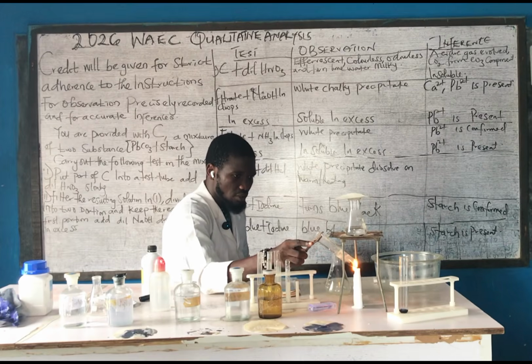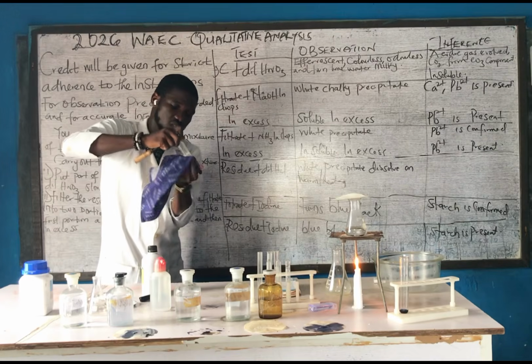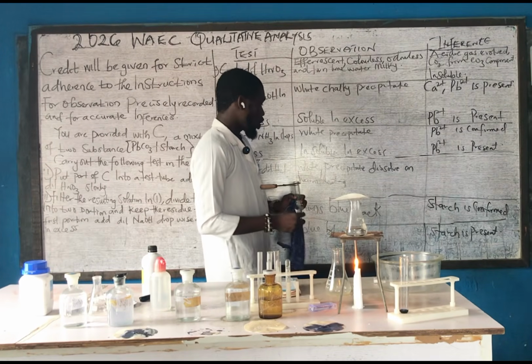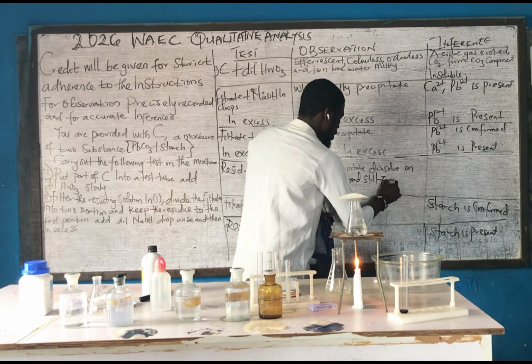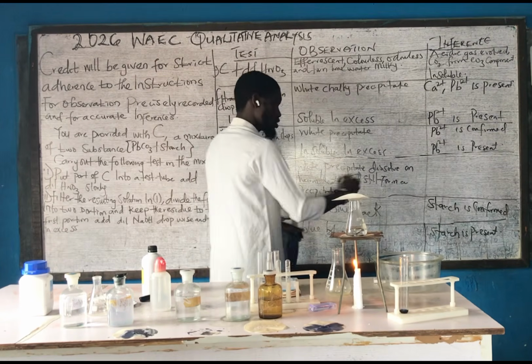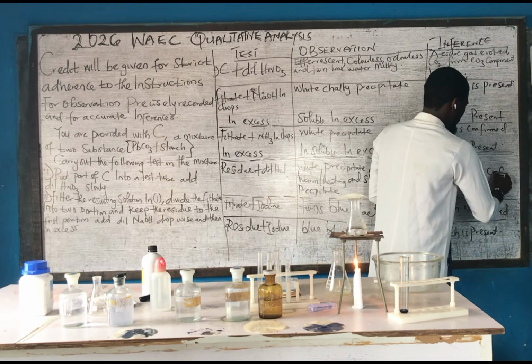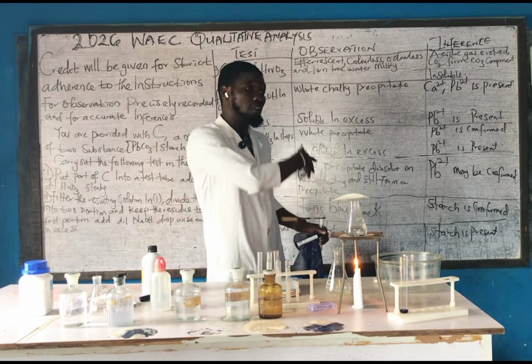Let's see what we are going to have. You see it now. When we heat it, the precipitate dissolves on warming, and then still forms a precipitate. So you can say Pb may be confirmed. So guys, we can say Pb is confirmed or present.